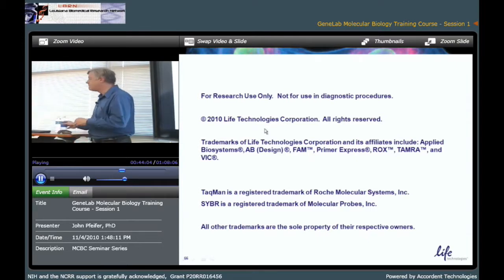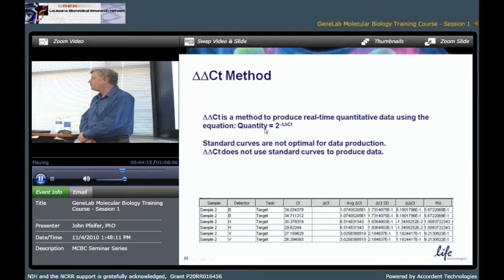Yes? So you suggested that the delta-CT method, once you've established a standard curve, you can have that in memory and don't have to repeat it every time you perform an experiment? Great question. If you'll allow me, I'll rephrase your question a little as I understand it. You're asking, is delta-CT dependent on running an initial set of standard curves, recording that data, and then using it in further analysis, for the same amplicon? Right, for the same assay curve, yeah.